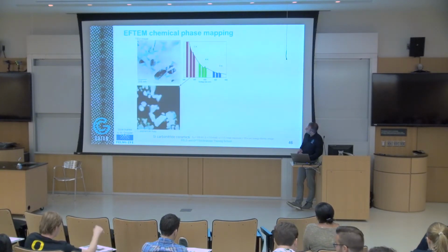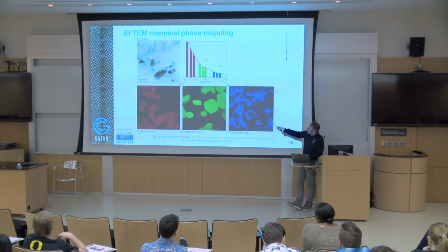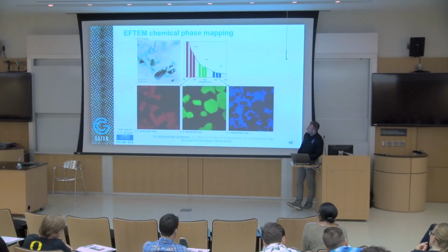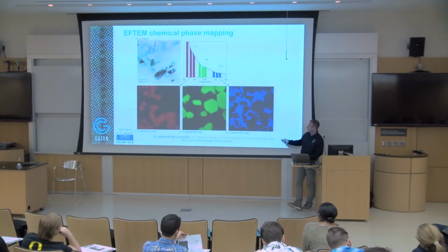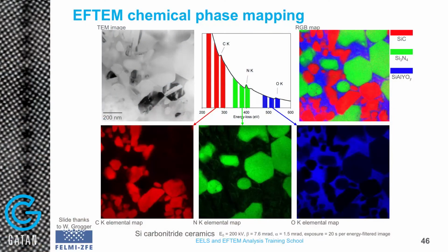Also, chemical phase. Yeah, that's taking nitrogen, carbon. You see here in the case of nitrogen, you're taking 3 images. Image post edge, pre-edge 1, pre-edge 2. Same thing you do for carbon and oxygen. And the software can be set up in a way that you just select all the elements. You can just click start and then come back and find all these elements, all these maps with assigned colors. You can put them together.